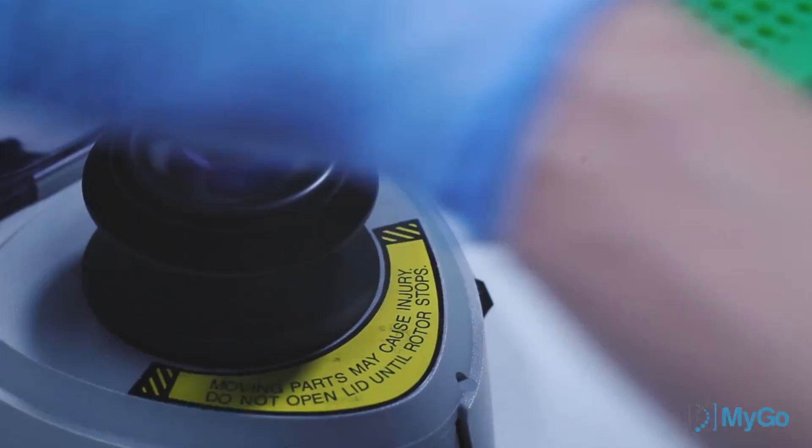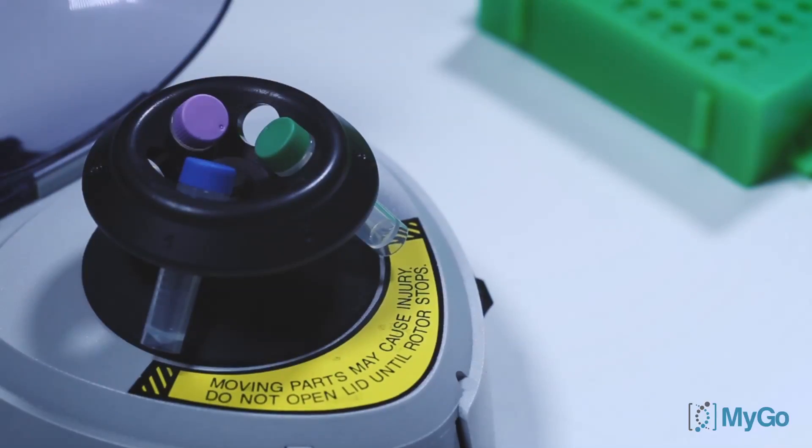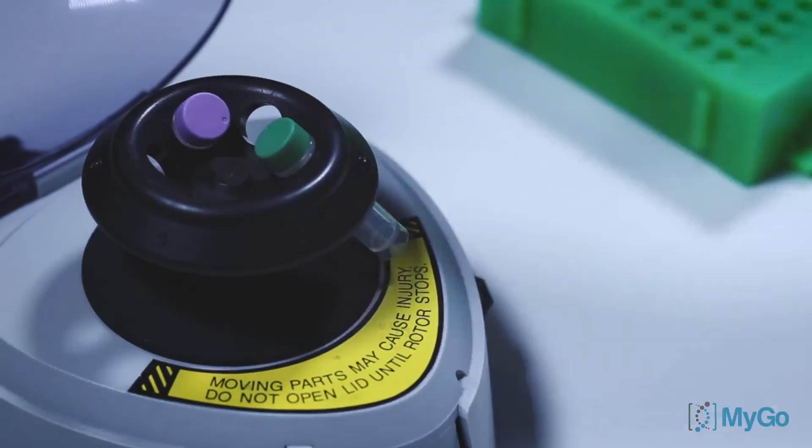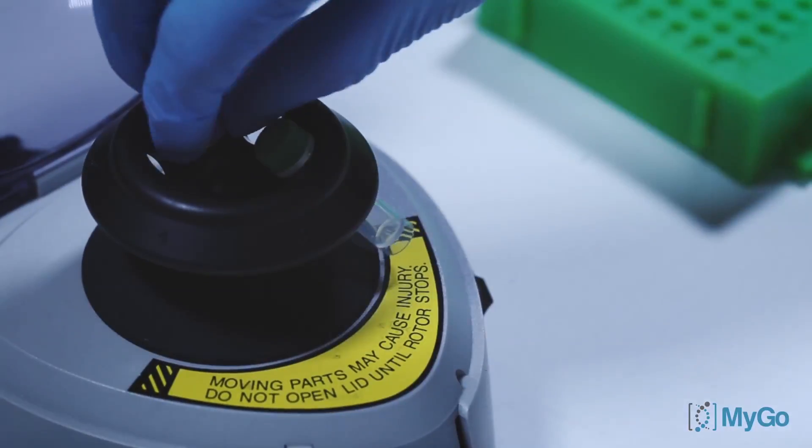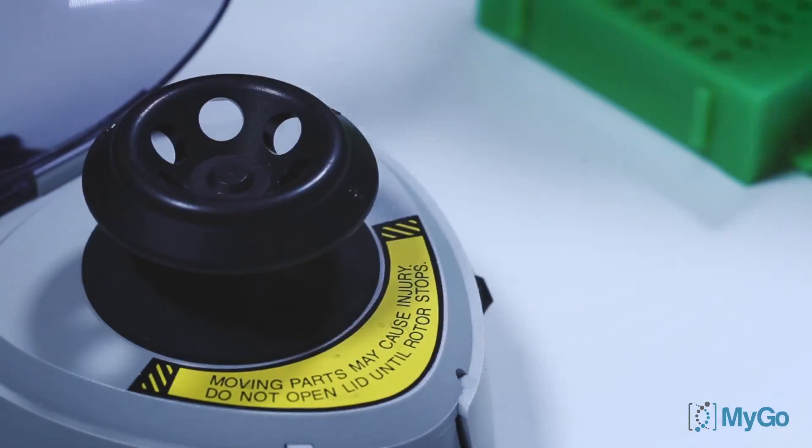Before mixing, centrifuge each tube to ensure all contents are at the bottom of the tube, and then leave for two minutes to settle. While we wait, we can get our tubes ready. We recommend using our MYGO 8-well strips.